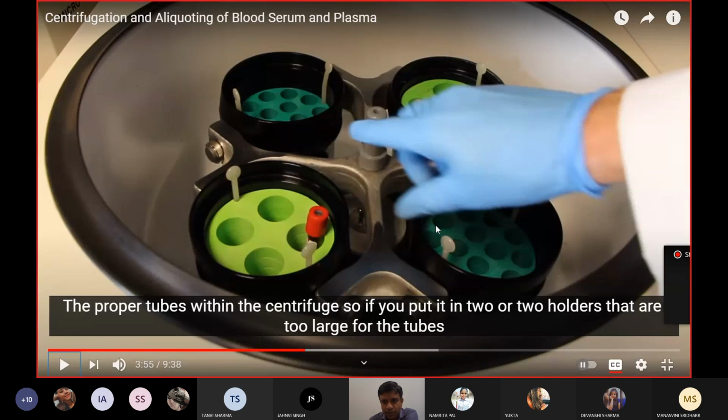Okay, so you can see this light green and light green, right? They are in front of each other. So they are balancing each other, and similarly dark green and dark green. They are in front of each other, balancing each other, right?